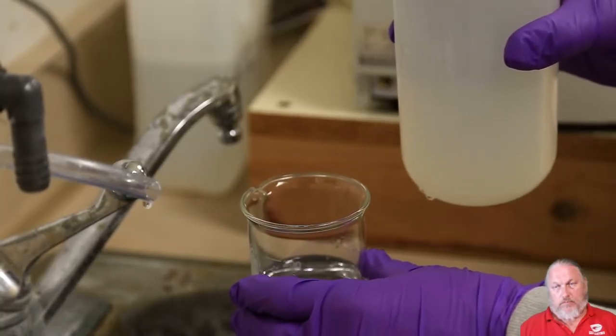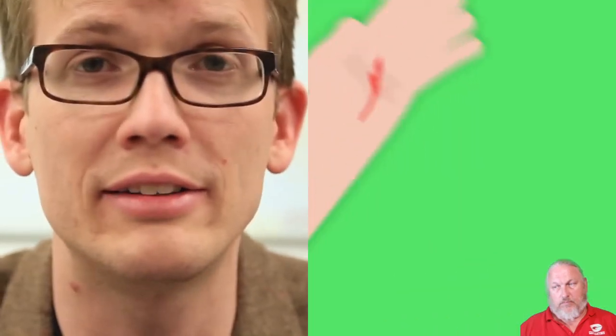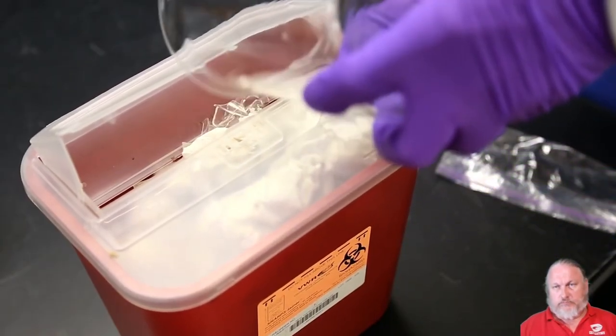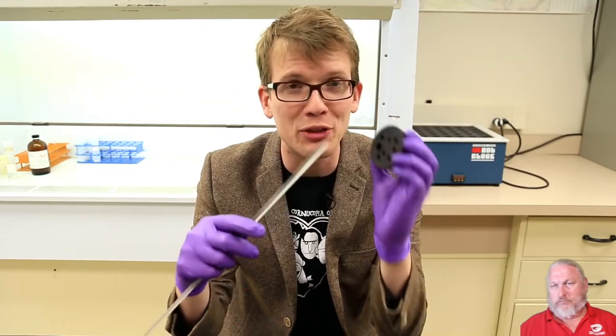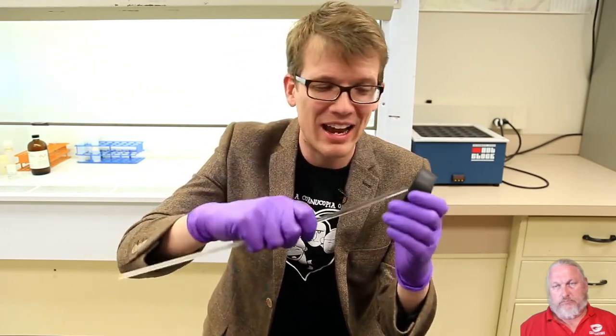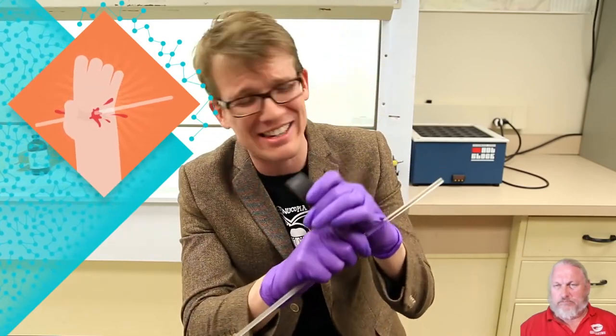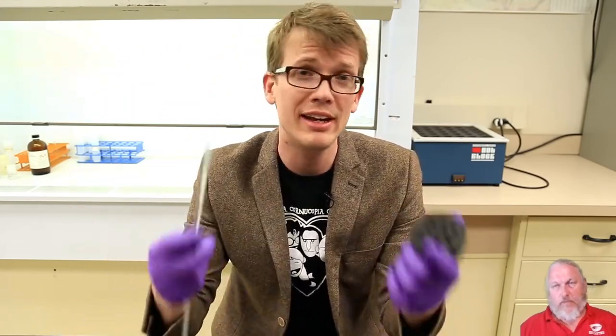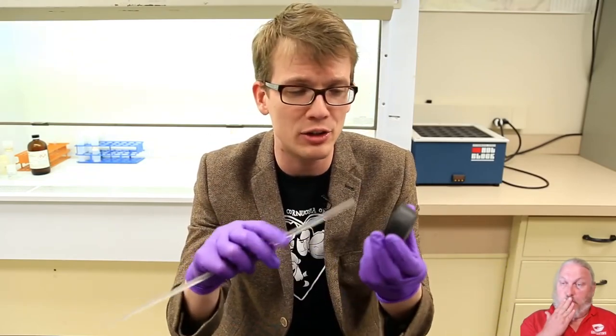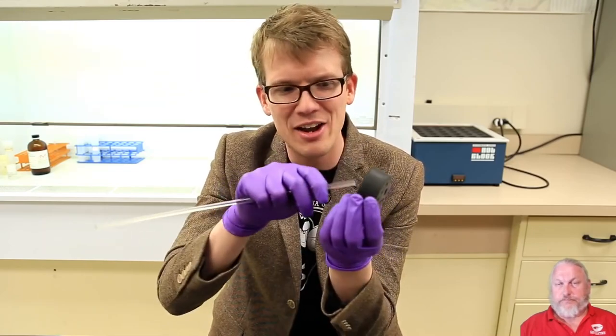Okay, back to safety. Most common lab injuries are cuts and punctures, and the most common source of those is cleaning up broken glass, which you should not do with your hands but with a broom and a dustpan, and then deposit the results into a bin specifically for sharp stuff. But the worst thing, and it has happened so many times and it is so terrible, is forcing a glass rod or a thermometer or piece of tubing through a stopper, and then it breaks and goes right through your hand, and you're in the hospital and you've been paying for the rest of your life probably. So when you're doing this, and it is sometimes necessary, you can use a bit of water or a lubricant or some kind of Vaseline to make it easier to go through, and then you hold it close and make sure your hand is not on the other side. Very close and make it go through like that, not like this.